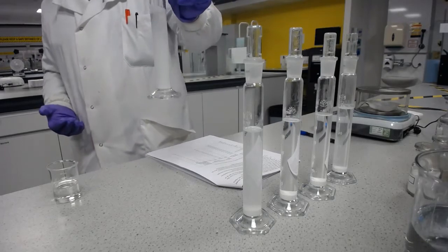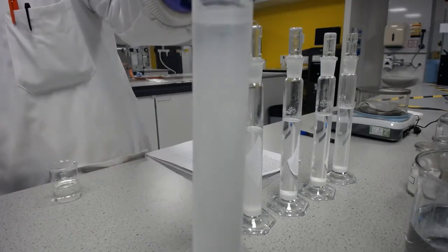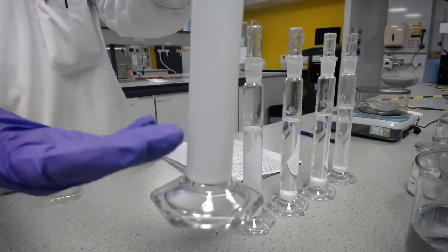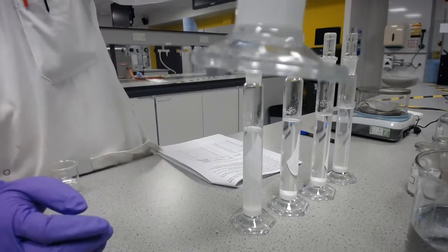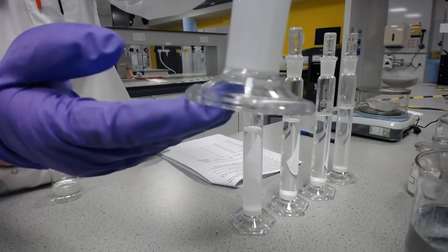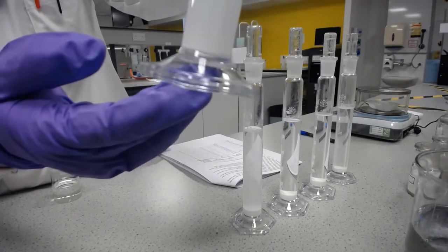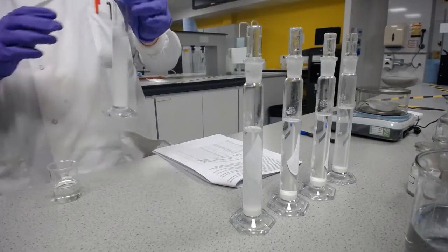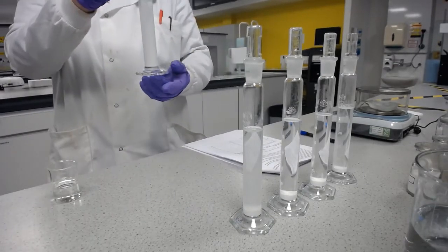Now, water looks quite good, but I'm genuinely not sure. If we look at the top there, we can see there is splitting, and we've got this very flocculent-like part here, which has split. So it looks quite good. However, right at the bottom, and I'm not quite sure if the camera will focus on this, but I'll take a picture of it, there's a really, really dense layer at the bottom. Now, I don't know whether that's caked or not, so we'll see. Now, we'll see how many inversions it takes for this to be satisfactorily redispersed.